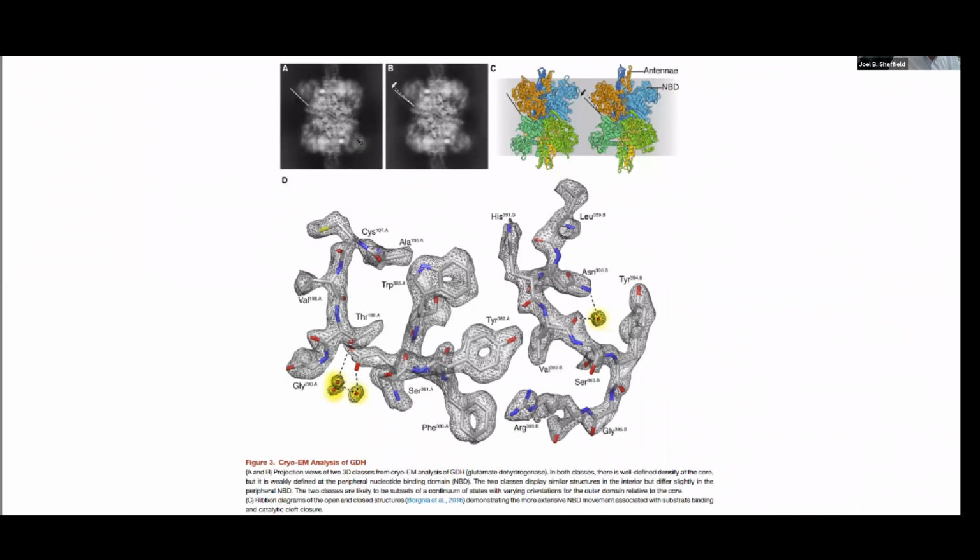So what they're suggesting here is that you can take images like this. This is of a different protein. This is glutamate dehydrogenase. And they're showing you, again, something about what you can see. These are the images here, these processed images. And then the material that you see down at the bottom comes from certain regions of this. And these are regions, I think, that you can see over here.